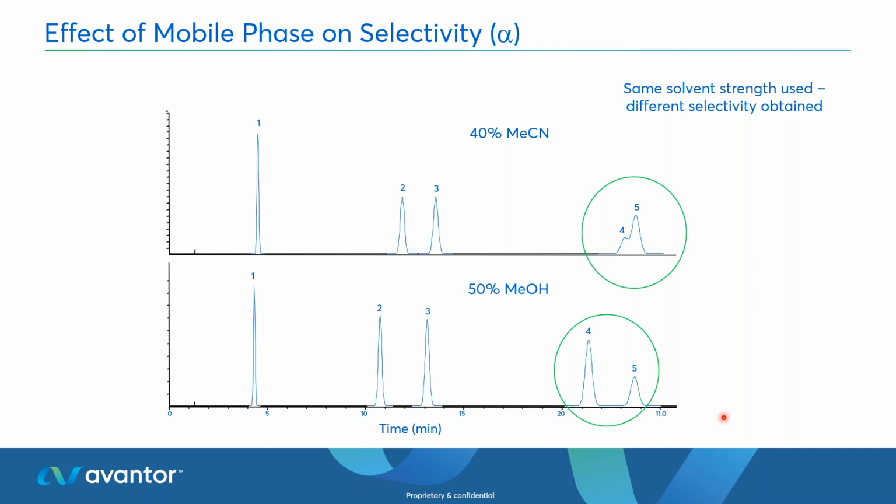It doesn't help you if you can't get hold of acetonitrile and you want to give exactly the same method. And this is the problem we came across when we were substituting acetonitrile with other organic modifiers, because the selectivity plays a role, especially if you've got ionizable compounds.